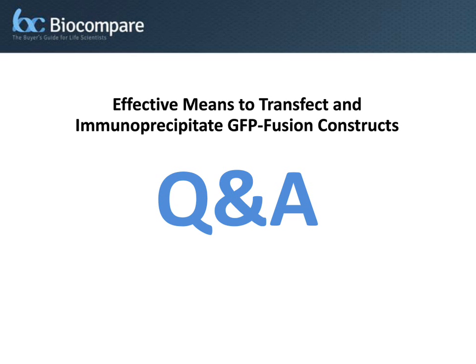Well, in general, when you're looking at primary cells and looking to transfect primary cells, we do recommend that you use the suspension method. It tends to give higher efficiencies. With that said, you can also use the adherent. For example, primary neurons are typically in an adherent state when they're growing, but when you harvest them, they ball up and you'll have them in a suspended state.